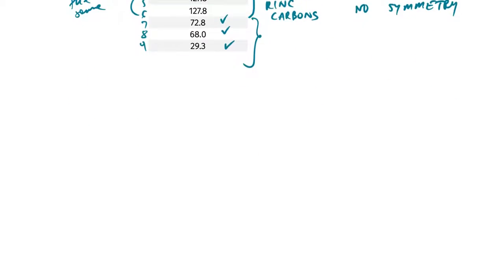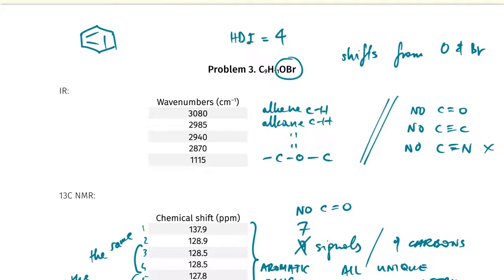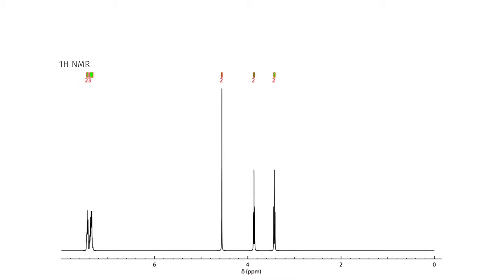Okay, so let's move on quickly to proton. For me, it's another slide. Okay, so we have a full spectrum where immediately what you can see is an aromatic ring at 7, 8 ppm. And if you look at the integration, how many protons do we have assigned to that ring?